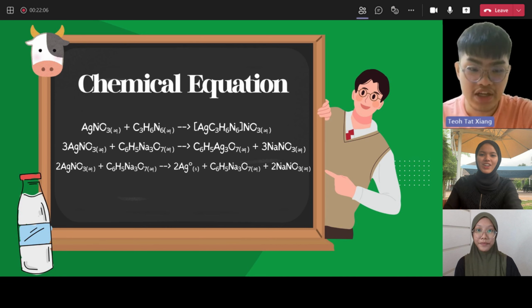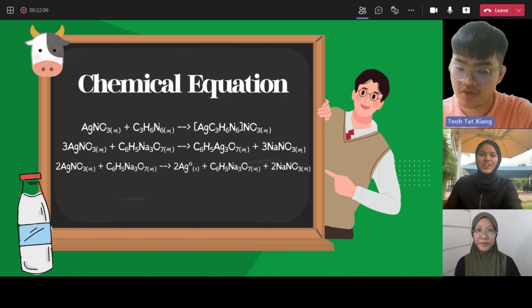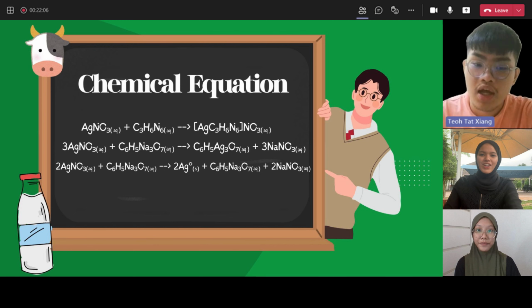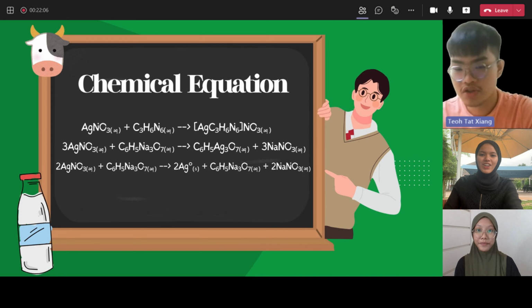This will cause the aggregation of the silver nanoparticles, leading to a color change. The silver nanoparticles are typically evenly distributed, so they give a yellow color. But when the melamine is added, they all stick together, clump together. So that's why the intensity will increase. Their optical properties will change, shifting the color from yellow to red.